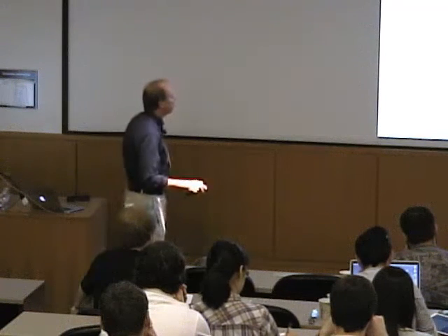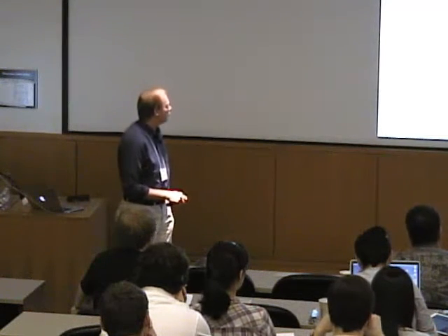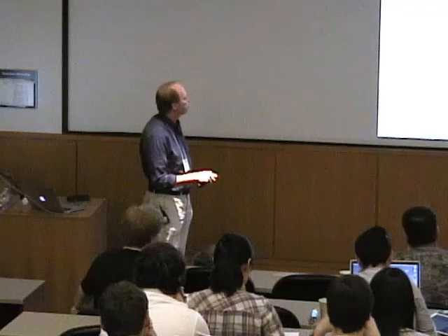So if I look at, for example, copper(II) just in a copper salt, we might get a g value of 2.1, right? Or titanium(III) in titanium oxide is 1.9, right? So there are slight shifts away from this value of 2 because of the contribution from the orbital angular momentum. But that contribution is normally relatively small. And so, of course, if we can determine that from a spectrum, you can use that to identify which species you're looking at.